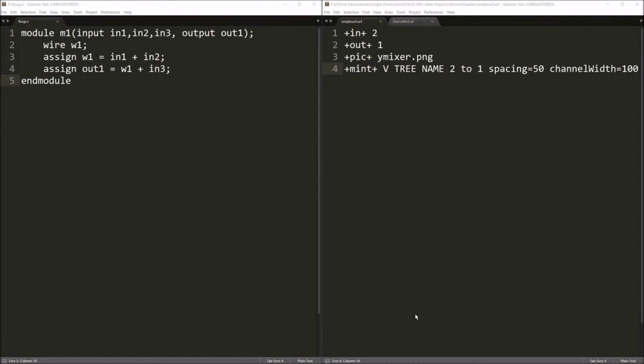For now, this user constraint file is implemented in a custom format. In the future, we'll move towards a more standardized format, like a JSON list of objects, with an object for each component type.